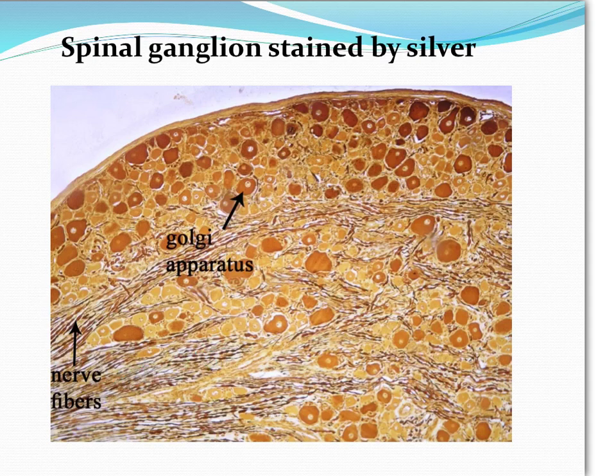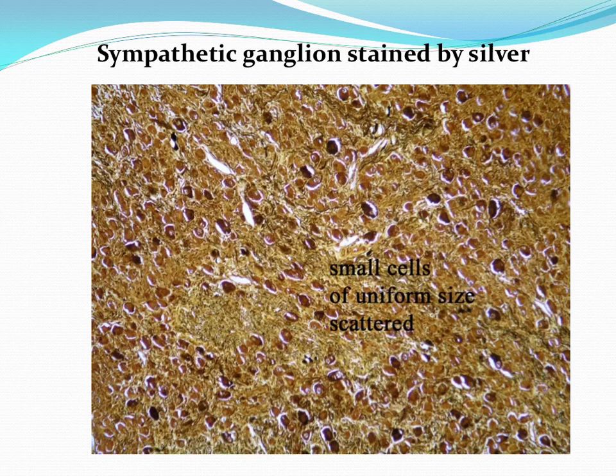the silver. And as I said before, these neurofibrils are nothing but neurofilaments stuck together to form a larger bundle due to the process of fixation used during preparation of the slide. This is a picture for the ganglion. Why? Because we have a large collection of nerve cells. Each nerve cell is surrounded by an empty white space. These cells are stained by silver.